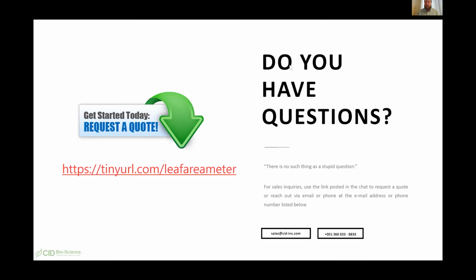If you're doing it non-destructively, most of the time I would say people prefer to use the CI203 because it is a little bit more convenient design for going out in the field and doing portable, on-plant analyses. If you know for a fact you're going to be harvesting all the leaves already, then it might just be easier to have the 202, and all you have to do is use the palette style and take all your measurements that way. I think that's the number one question you have to ask yourself: is destructive okay? Or is it imperative to the study that I leave the leaf on the plant?